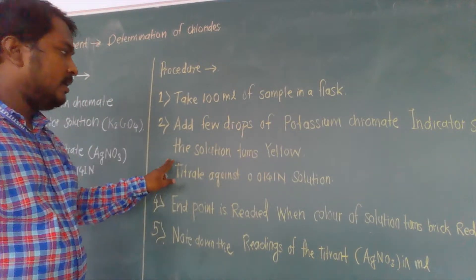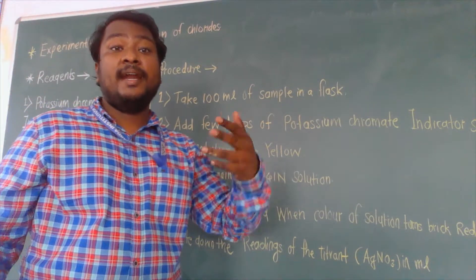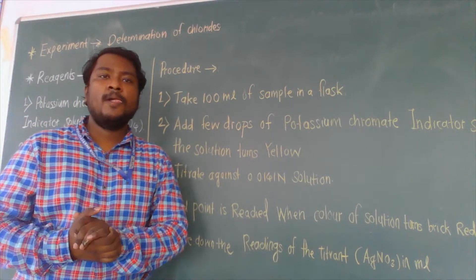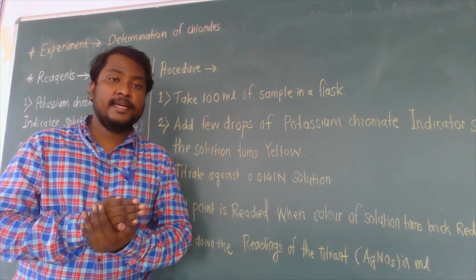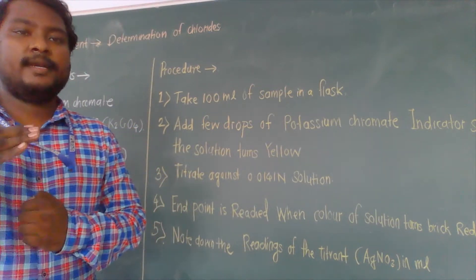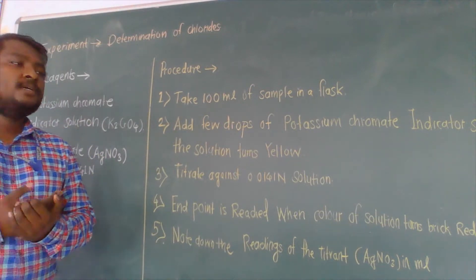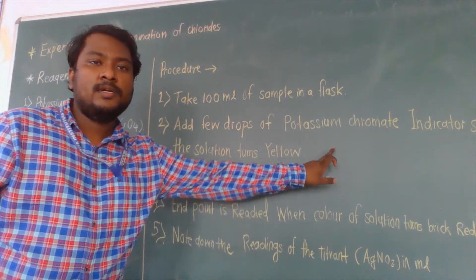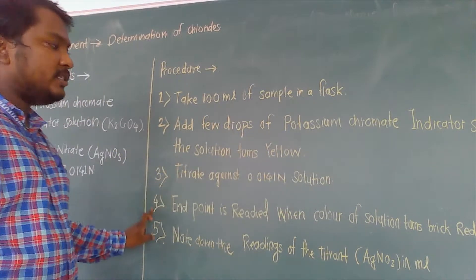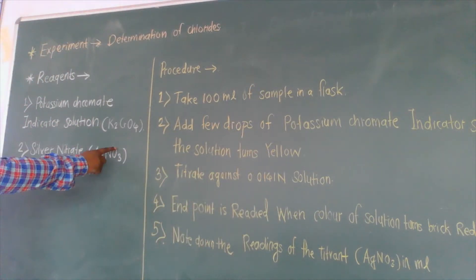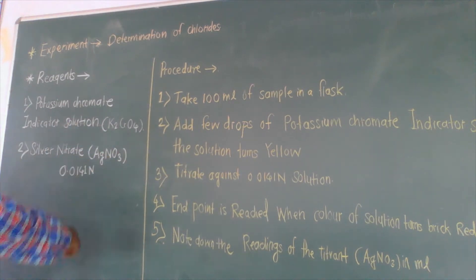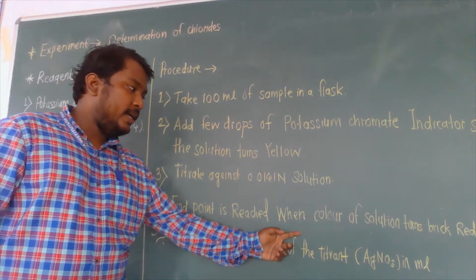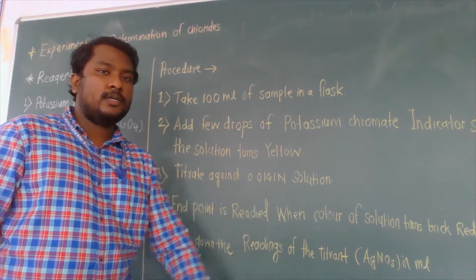Step two: add a few drops of potassium chromate indicator so that the solution turns yellow. After adding two to four drops of this potassium chromate indicator, the solution turns yellow, which indicates the presence of chloride content in the water or wastewater sample. Step three: titrate against 0.0141 normal silver nitrate solution (AgNO3). The end point is recorded when the color of the solution turns brick red.